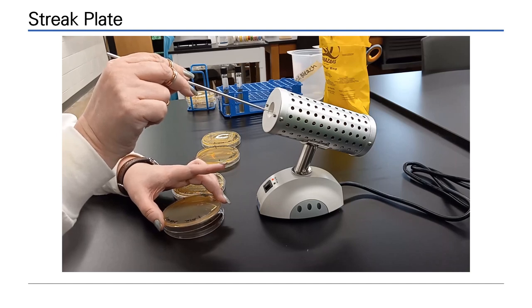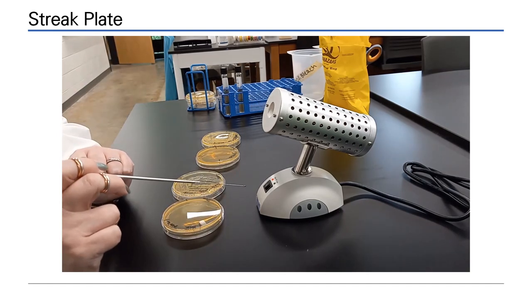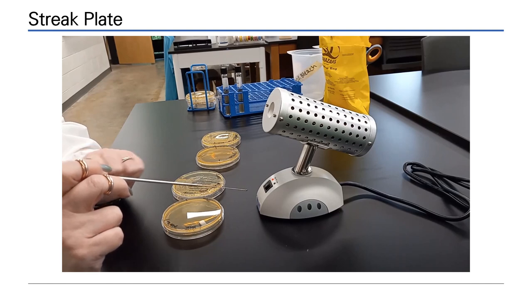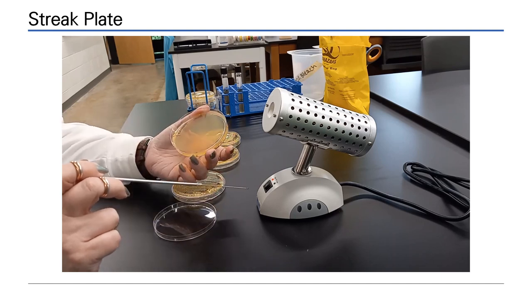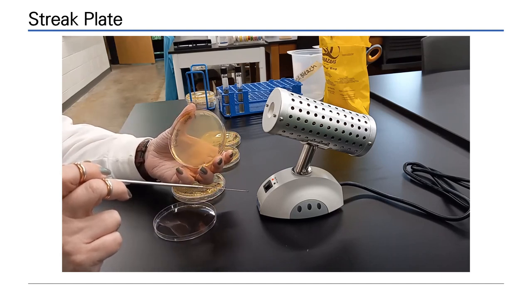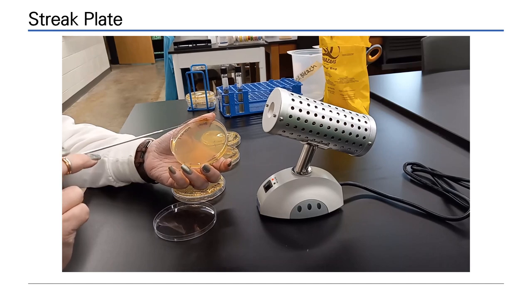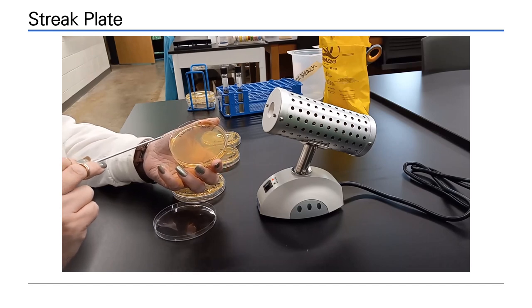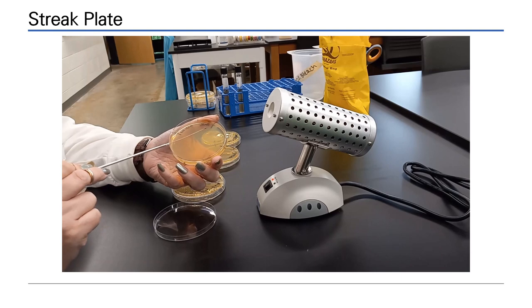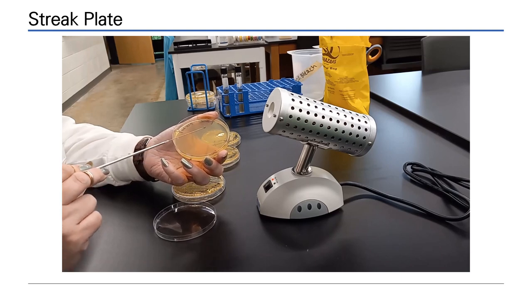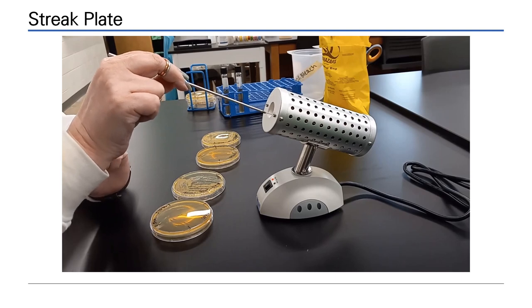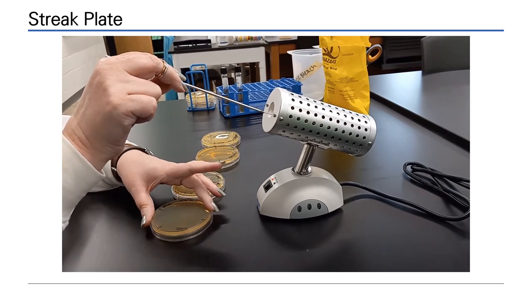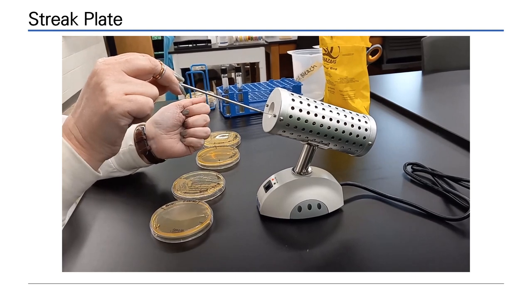Re-sterilize and kill all of the cells on the loop. This adds to the dilution effect. Fewer cells will be picked up from the first quadrant and moved into the second. The plate is rocked in the light so that you can observe where your streak ended. Enter the streak twice and drag across. Then do not enter the streak and drag across into the next quadrant. This also causes dilution.